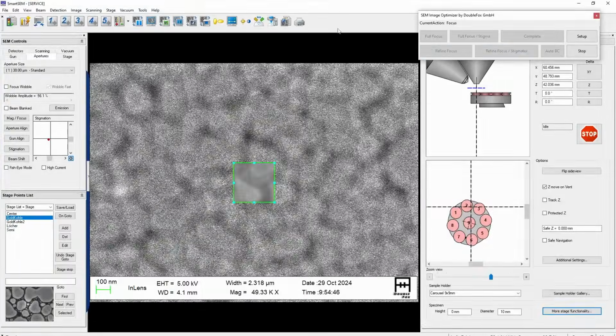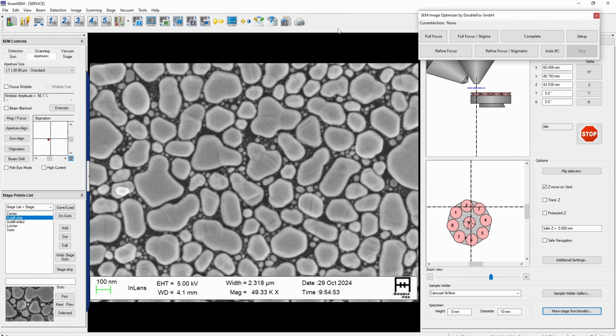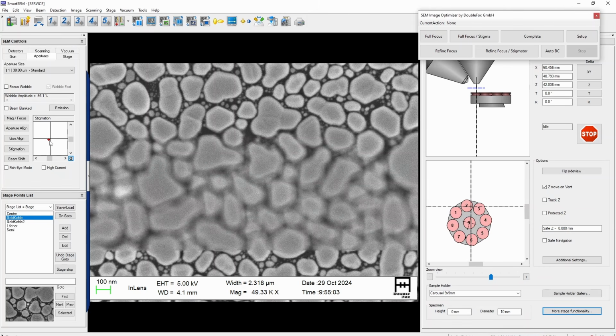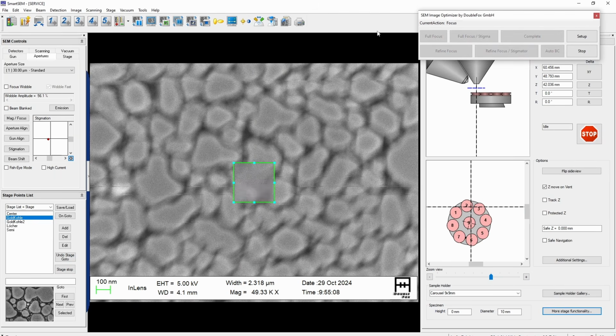For scanning electron microscopes, this means a longer process needs to care about focus and stigmata changes and control these settings from time to time to keep a good image quality. For an automatic process, autofocus and autostigma routines must be fast, reliable, and controllable by software, as no user is there to check the outcome of an autofocus or autostigma process. The standard built-in interactive automatic functions are often not reliable enough to run without user interaction.